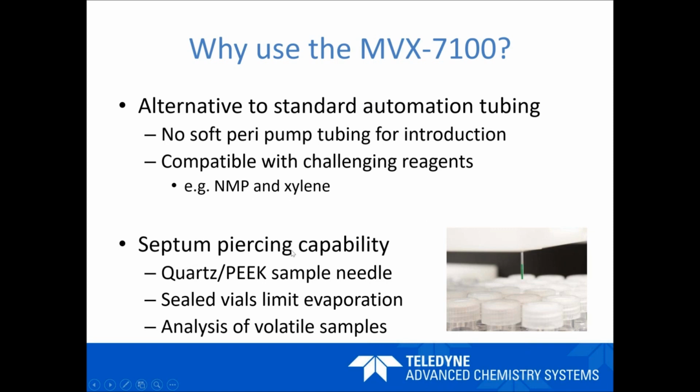Septum piercing, I've mentioned a fair bit through the presentation as well. The idea is being able to protect your sample, having it protected in a particular vial in a finite volume, in the event that you've got volatile organic matrices or volatile sample types.